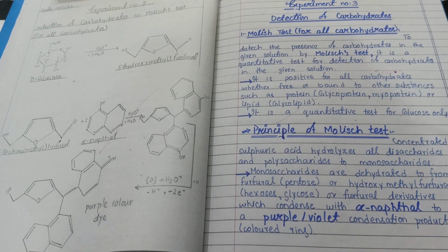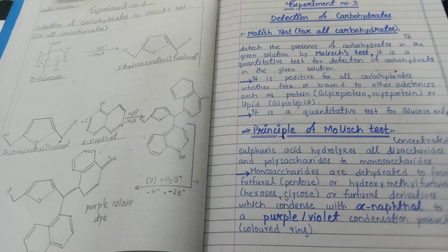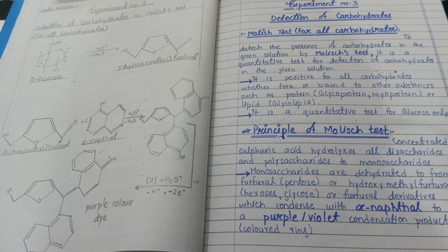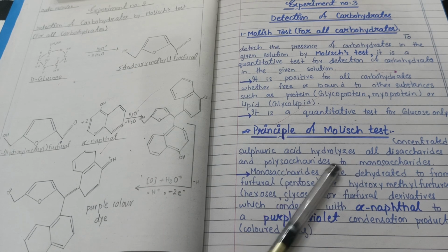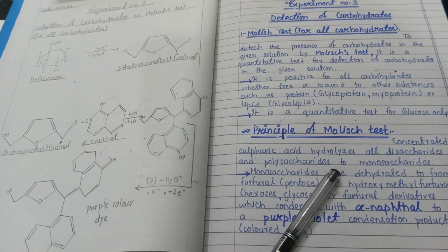Now, this is D-glucose, which is a monosaccharide, but in the solution you could be given a polysaccharide or a disaccharide. Whenever you are given such complicated sugars, you first have to add concentrated sulfuric acid to it. What is the purpose of adding concentrated sulfuric acid? Concentrated sulfuric acid hydrolyzes all the disaccharides and polysaccharides to monosaccharides.